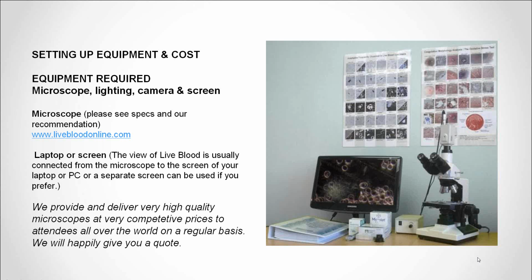You do need, with live blood analysis, to see the majority of the things that we look for in dark field. You actually need a very, very high quality dark field system, which requires a very specific type of dark field objective and a very bright type of illumination. So most of your standard microscopes that are available just don't provide you with the correct amount of illumination.